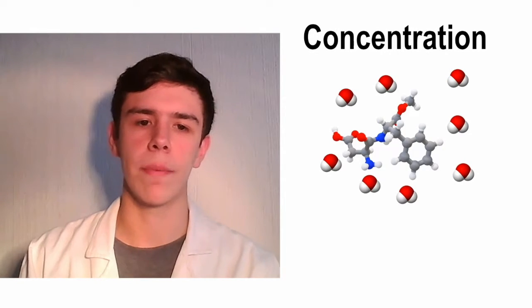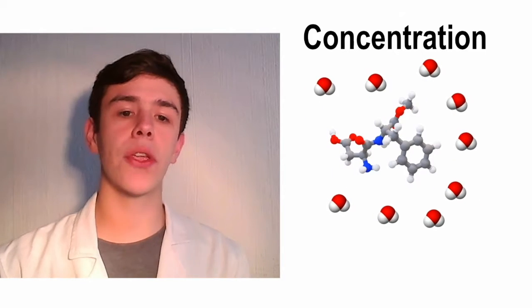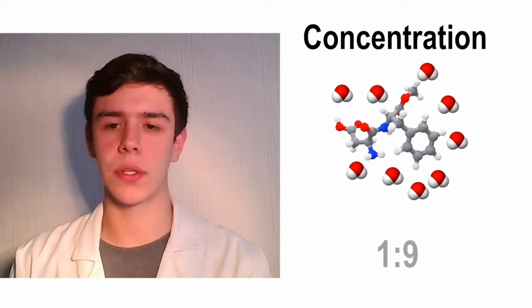In this laboratory session, we prepared several solutions at different concentrations that involve several types of proportions between a solid, solvent, and solution. Before engaging in the actual preparation, we had to consider substance properties such as the molecular weight, density, volume, and pH to determine the storage vessel and the measuring tools as well. Concentration can be defined as a pure proportion that exists among the components of a mixture. This measure can be useful to study phenomena like molecular interactions, stoichiometric proportions, and velocities of reaction.